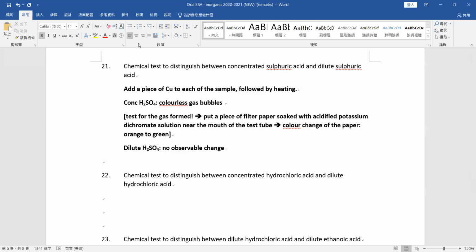Chan Wai-ho, I don't usually see you answer so fast, but now so rapidly. Yes, that's right. So the piece of paper will char. It will turn black, or maybe even have a hole in the area where the concentrated acid meets the paper. So this is also possible. This time I would test the dehydrating property of concentrated acid.